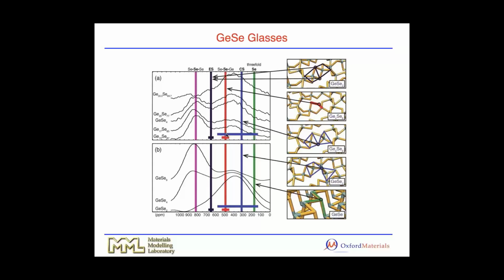The corner sharing can have quite a range of different chemical shift environments, and so we were able to then start to give an atomistic interpretation of what these solid-state NMR experiments on the amorphous materials mean in terms of the underlying chemical structure. Okay.